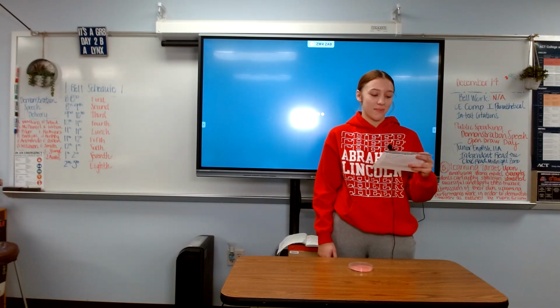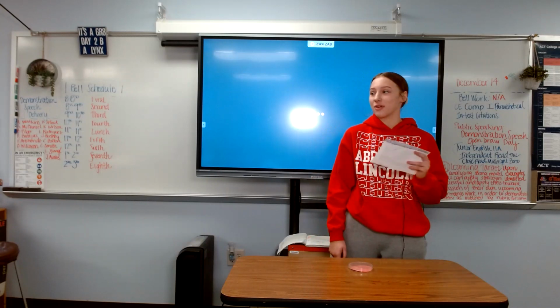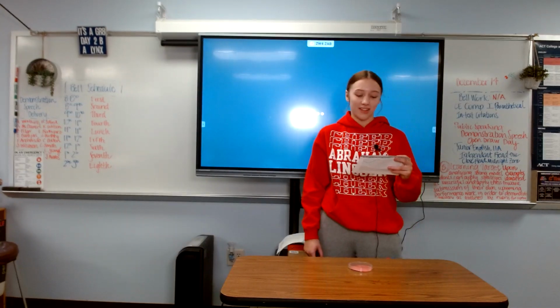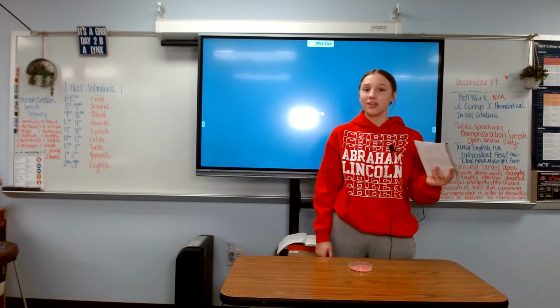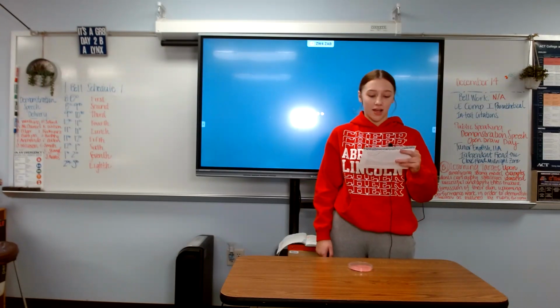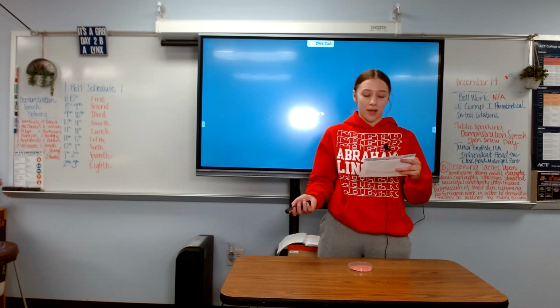Streaking for isolation. That might sound very complex, but I assure you it is relatively simple. This simple test allows labs and pathologists to help diagnose someone in need. For example, wound tissues might need to be swabbed and used to help diagnose what infections they might be brewing.